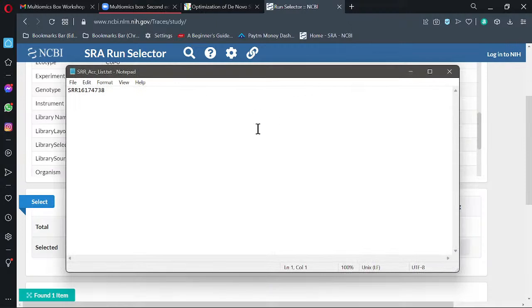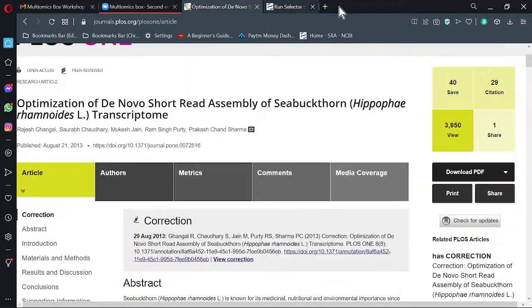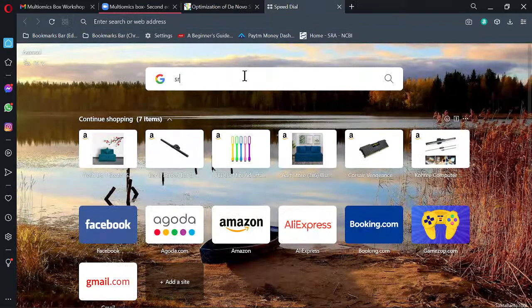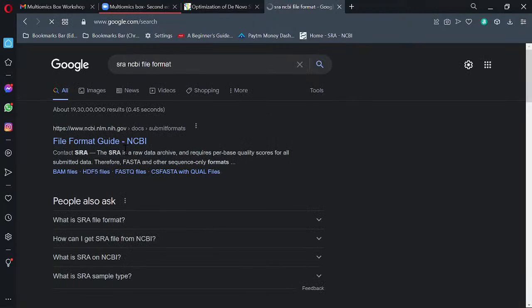Is that okay, Shobita? Yeah, indexing is just small files. Convert the big genome file into small files. That's it. And then we will perform the quantification. Quant is simply quantification: how many reads are present for a particular gene in a file. And then we will do the 3D RNA-seq analysis using R tools.